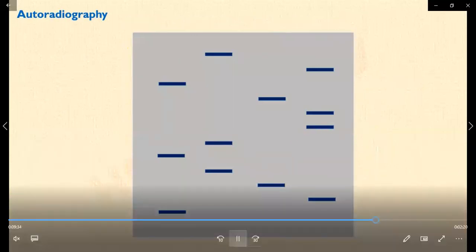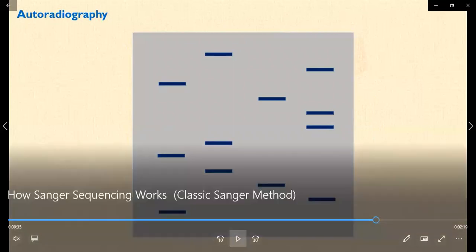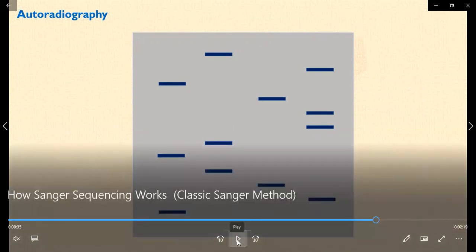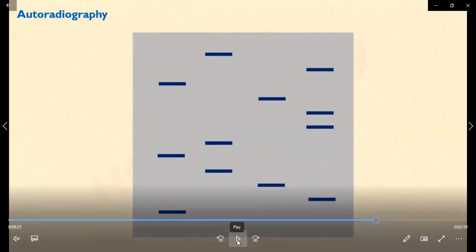You can pick up the strands from the gel by a nitrocellulose paper. ठीक है, जस्ट लाइक अ ब्लॉटिंग पेपर. और फिर उसको ऑटो रेडियोग्राफी से हमें पता चलता है. प्रेजेंस ऑफ द प्राइमर्स, क्योंकि वो रेडियो लेबल हैं, इस वजह से आपको फिर ये स्ट्रैंड्स नजर आ जाते हैं. You cannot read the sequence directly from the gel. You have to pick up the bands from the gel, and you have to pick up the bands soon, because if you allow the bands to stay on the gel, वो फिर उसमें सिंक कर जाएंगे.